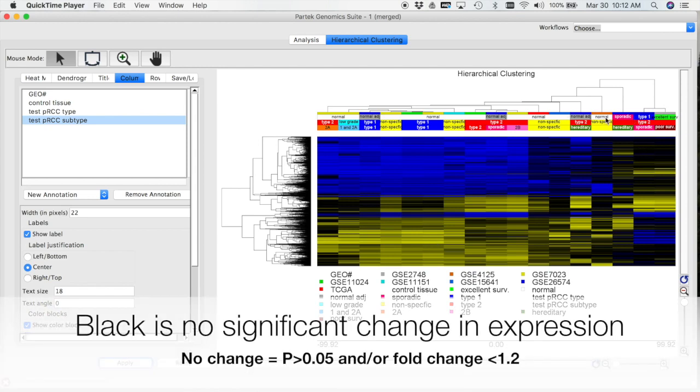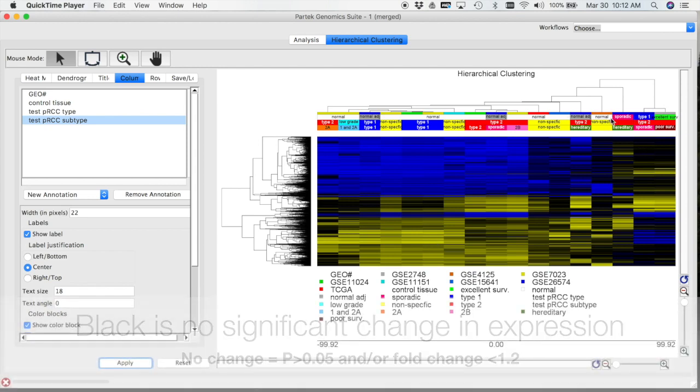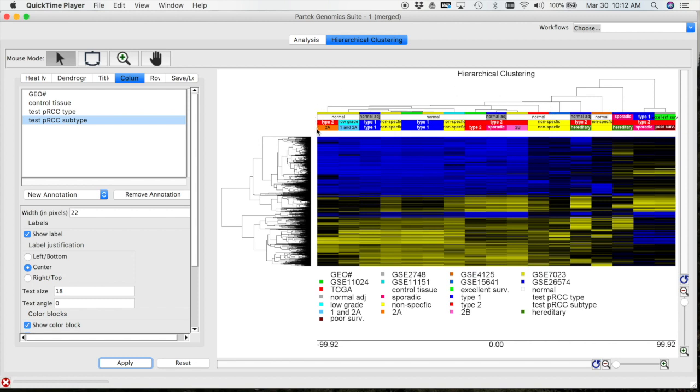You can see that we're getting very distinct clustering here, that all of our comparisons involving cancer versus normal seem to be on the left, while our three comparisons looking at cancer versus cancer are on the right, and they look very different. And what's really nice is you can kind of use this to find specific groups.